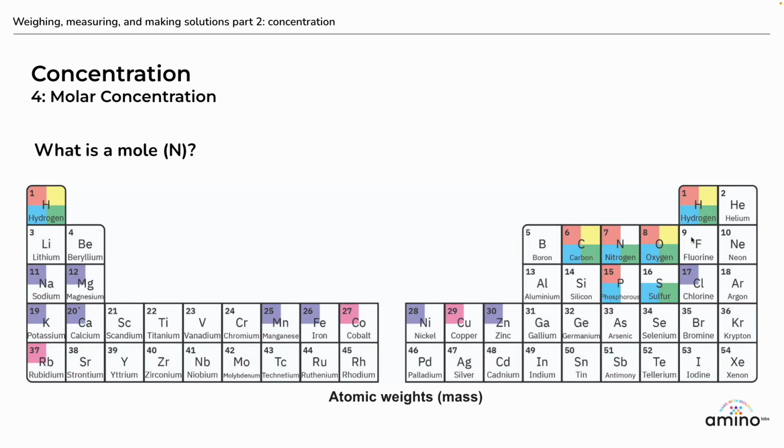Perhaps when you were learning about the periodic table of elements, right? So yeah, an important part of understanding and calculating a mole is the molecular, or I guess in this case, atomic weight of the chemical elements, right? So each atom has a different mass or molecular weight, and that is in the units of grams per mole. All right.